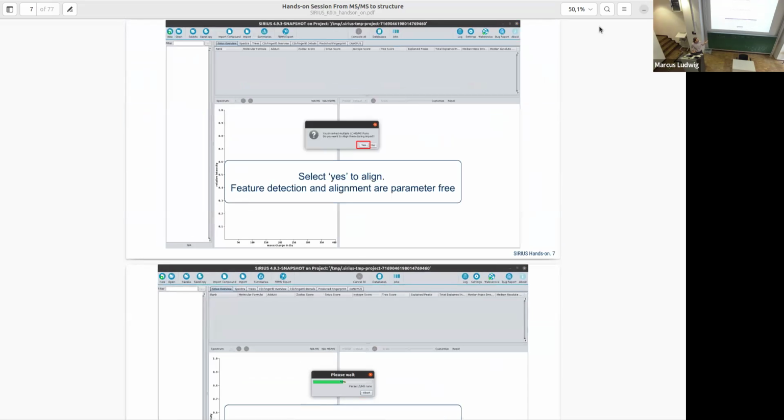Not everything, but most of it. So it probably makes no sense to switch back and forth all the time, but I leave it open and you can have a look. So at some point when you don't know what to do, you always have the slides to go back and get an idea what the next step was.